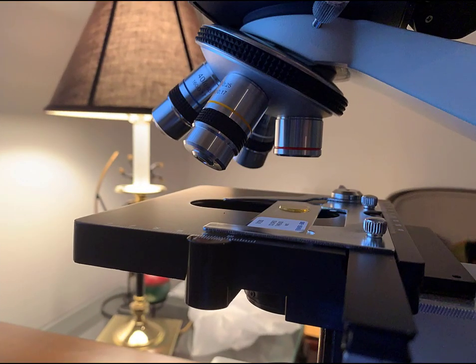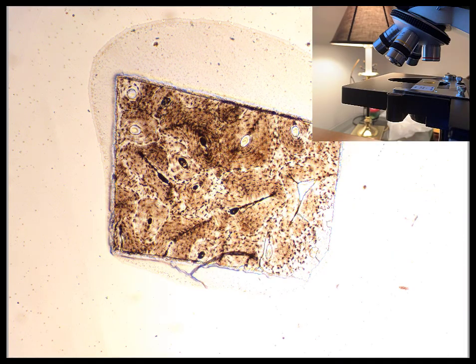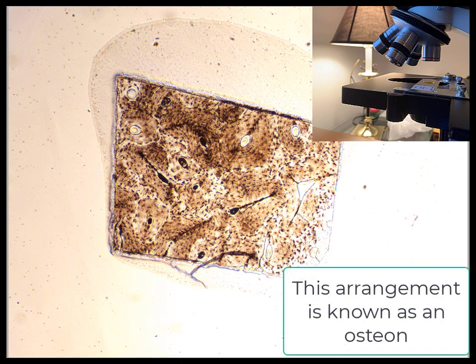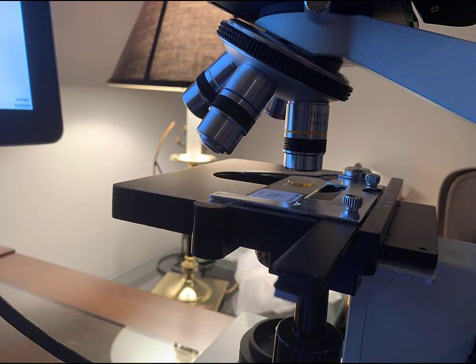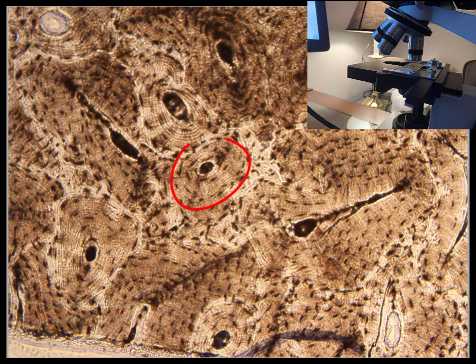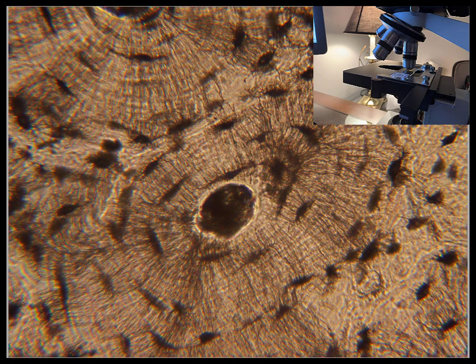Now let's see what this looks like under the microscope, starting with our most zoomed-out view with the scanning objective lens. In this case, we're going to look at a sliver of human compact bone, which is made up of little columns of bone arranged in concentric circles around a central canal. Let's say this one is our osteon of interest. Now we're ready to switch to our low power objective for a closer look. Once we have identified our target of interest, we can fine-tune our focus and move on to the high powered objective. At this point, it should take very little adjustment on the fine focus knob to bring our subject clearly into view.